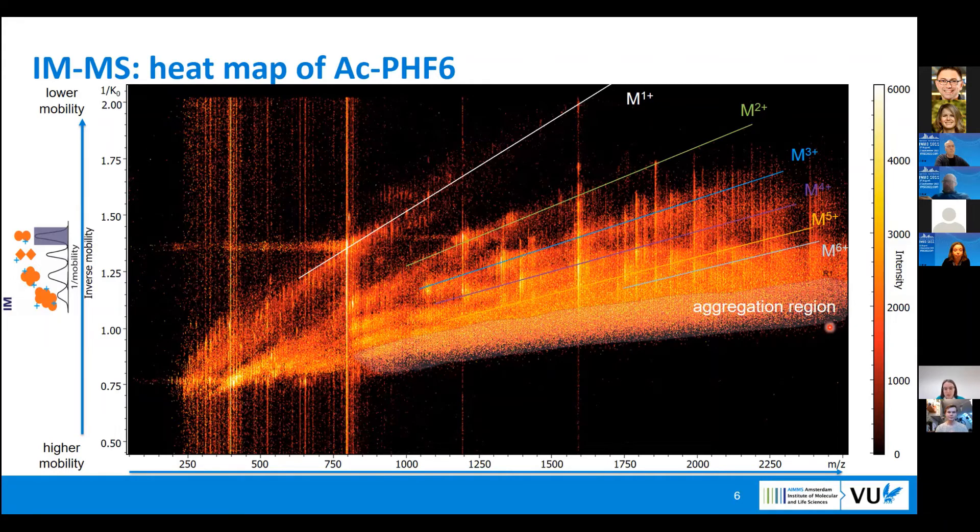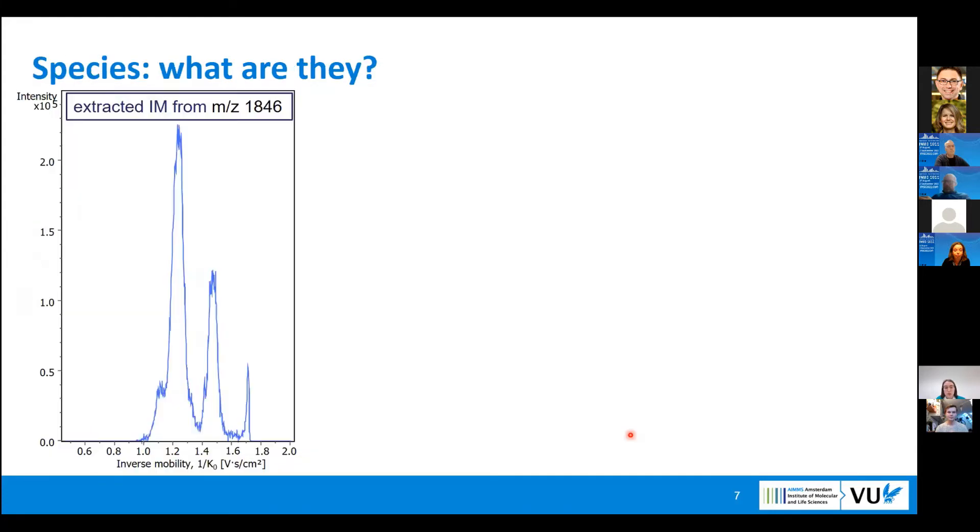For further analysis, I will focus on this particular m/z value to characterize the species that are present there. How we analyze this: we want to know what species are present. We extract ion mobility from this m/z value and we end up with three peaks.